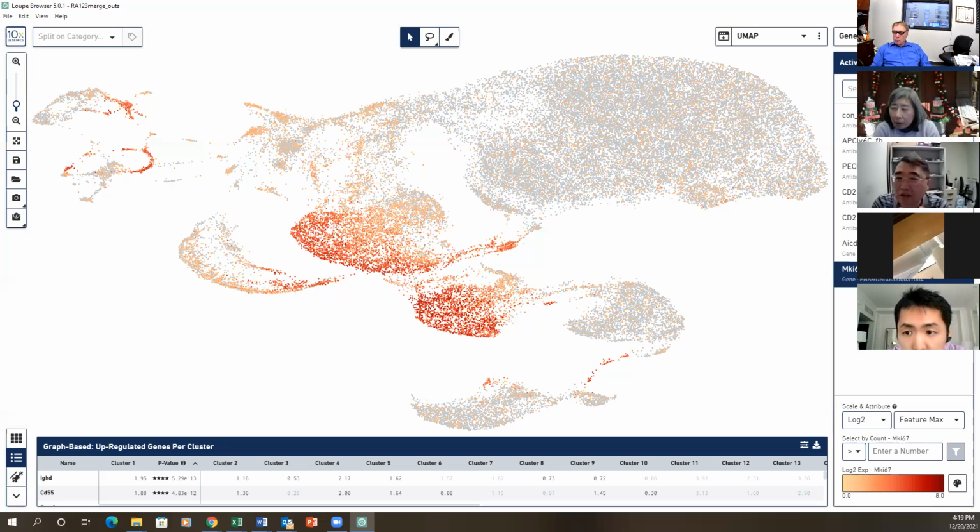Because in this experiment, with the CiteSeq, you look at the bottom, you can pick any population, then click a button and it shows you the differential expression. You have an option whether you compare genes or you compare the antibody. When you look at the antibody, they all show up in knockout, almost globally the protein level reduced.